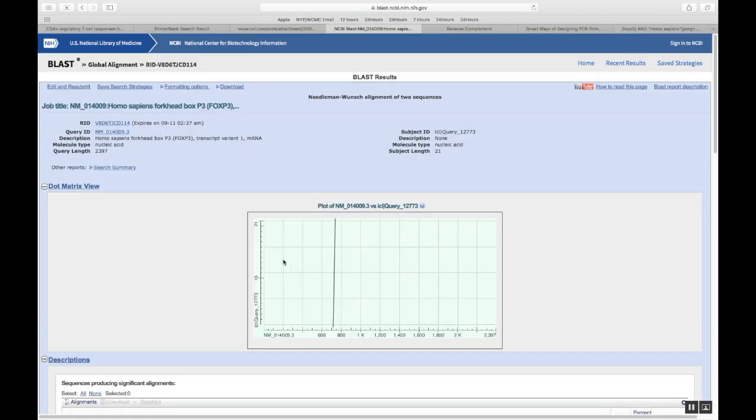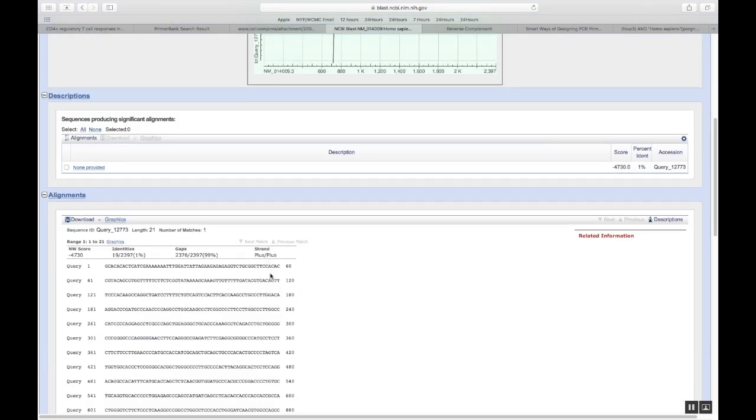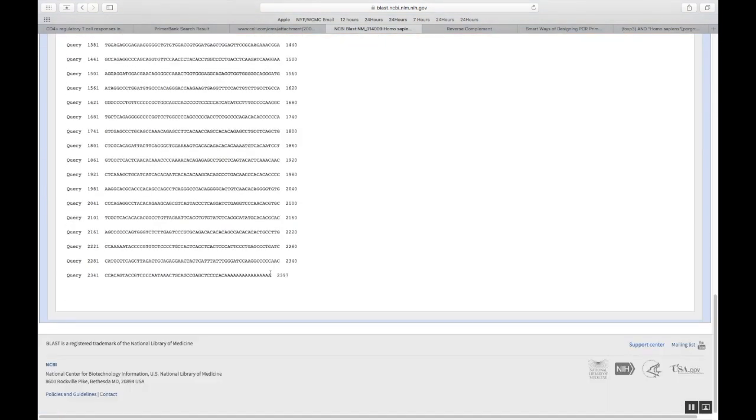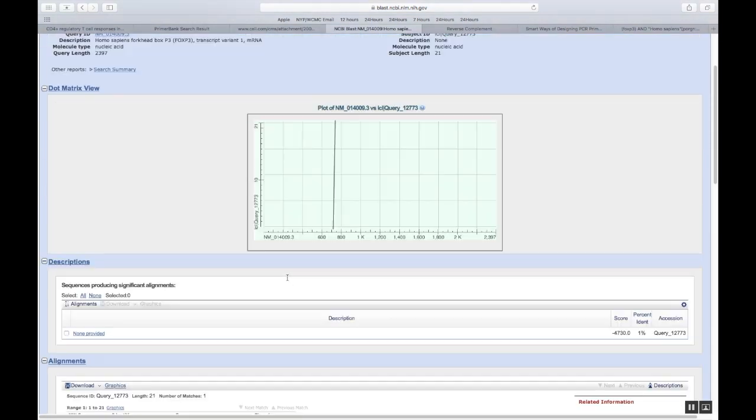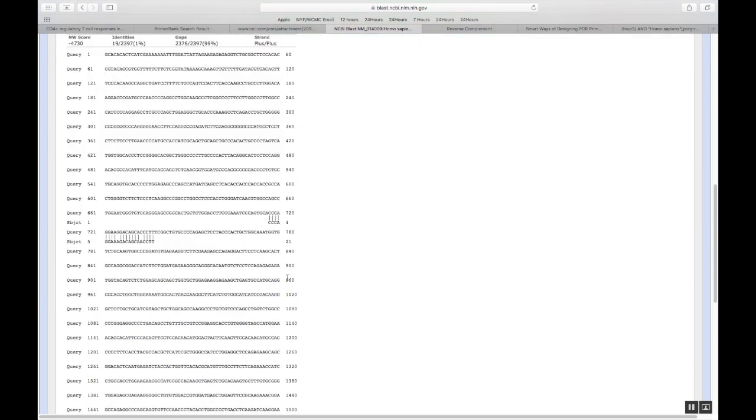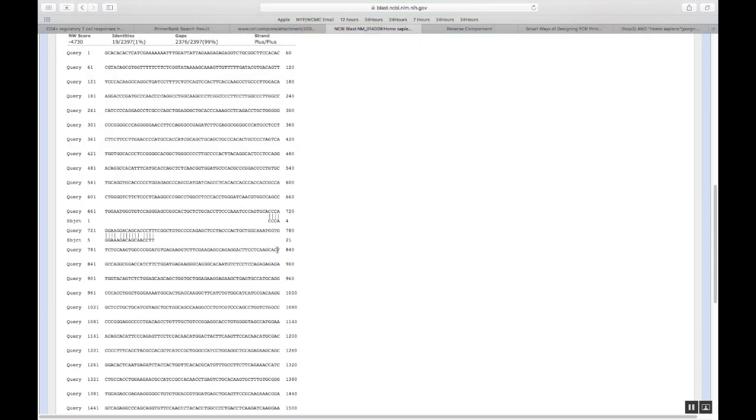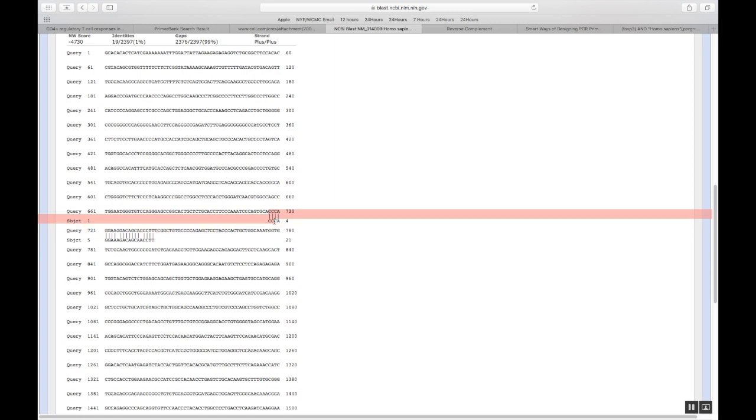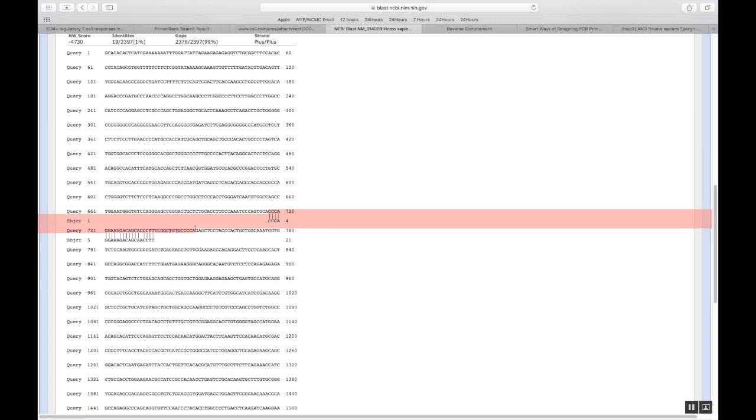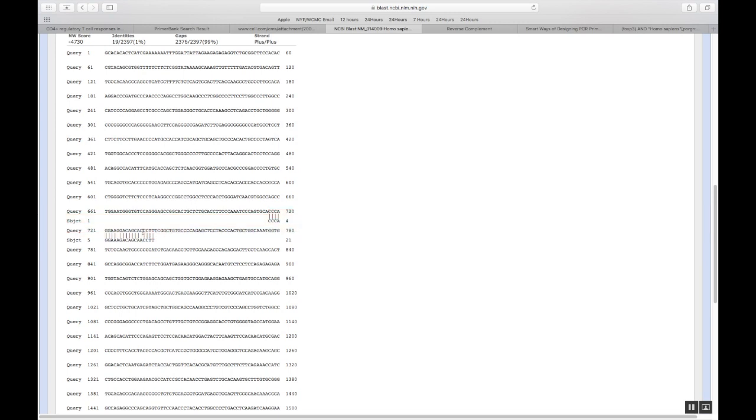Within a second or two, you'll get an alignment. This is your whole FOXP3 sequence. The cDNA sequence. And your primer, your forward primer, starts here around 716, 717. And it goes till here. Just remember, it is CCTT here. CCTT. This is where it is ending. This is where the forward primer is ending.